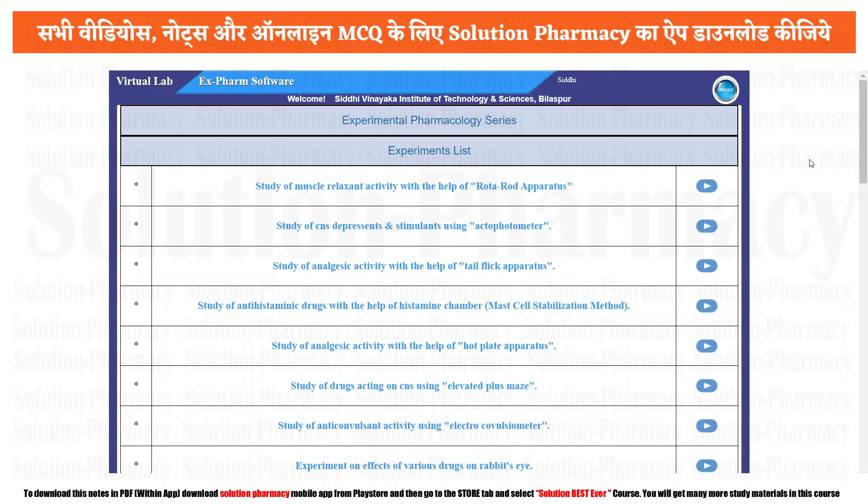Hello friend, welcome to LChannel iSolution. You are watching our Xform exclusive video series and for today's experiment we are going to study about the muscle relaxant activity of a given drug with the help of rota rod apparatus.